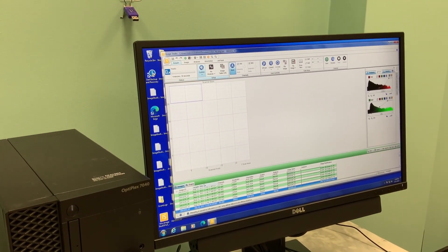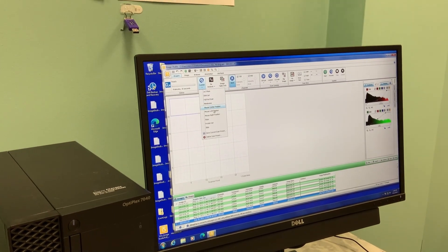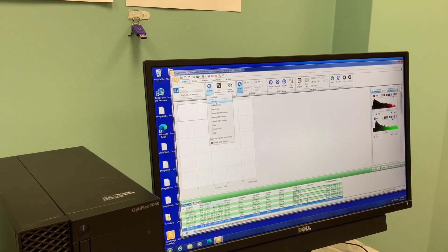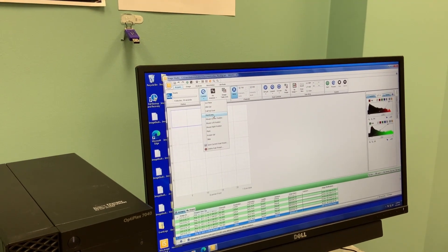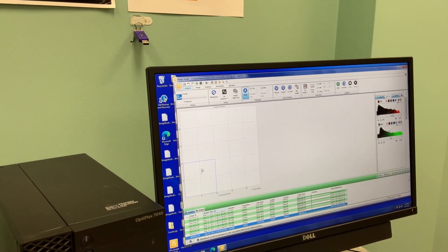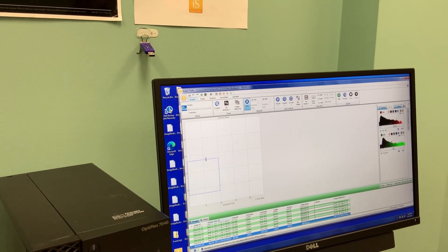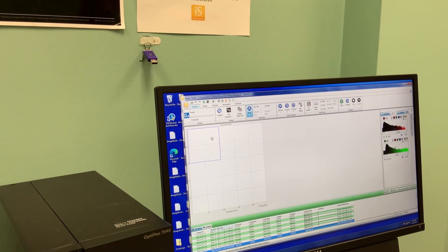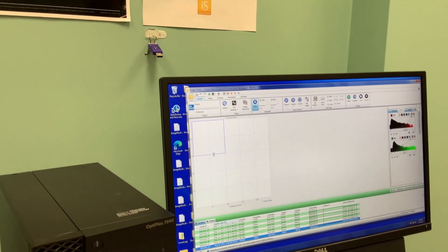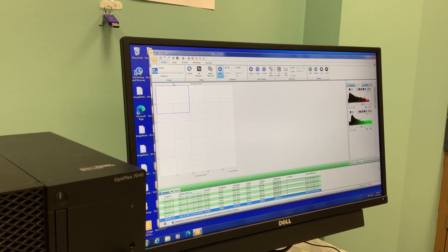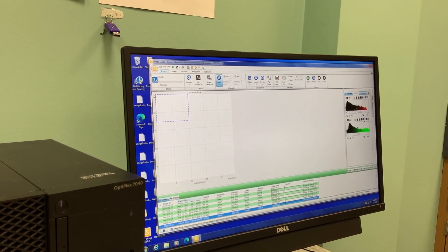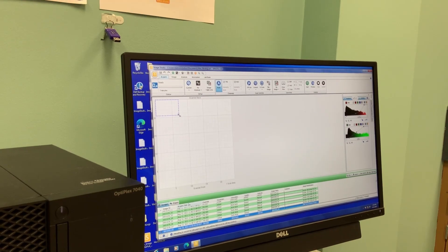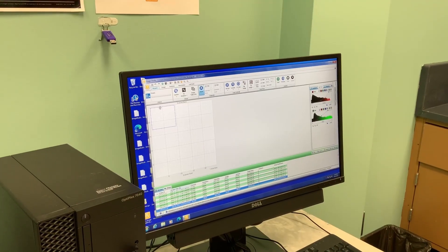What I typically do is hit Membrane and then you can click in this area and drag this box up. If you remember, we were at two major ticks and then one and a half major ticks in this direction, so this is my area. Your membrane will probably be smaller than this if you were to do a membrane, not a piece of blotting paper.